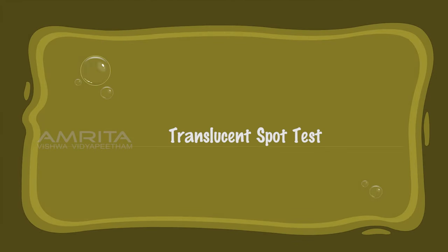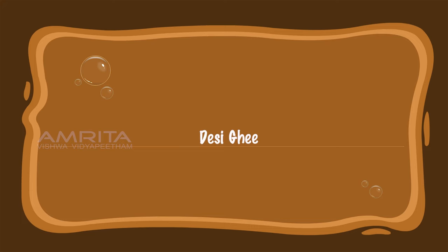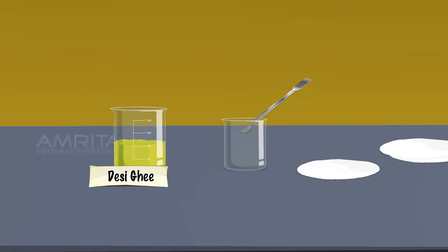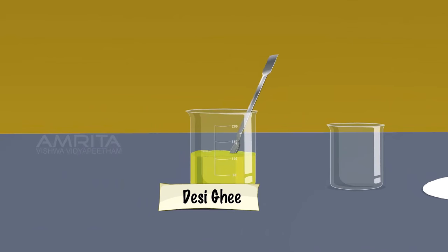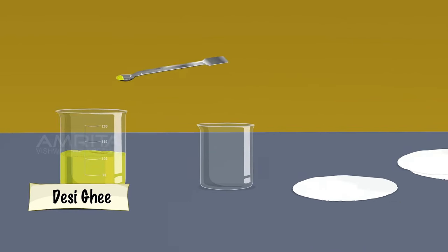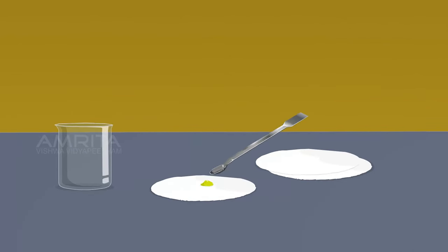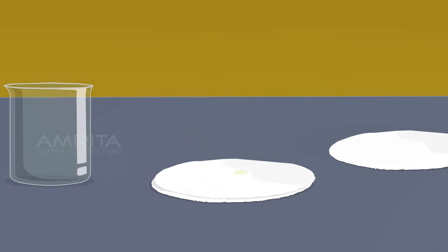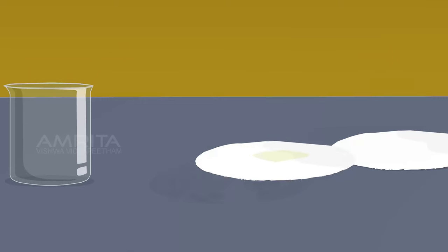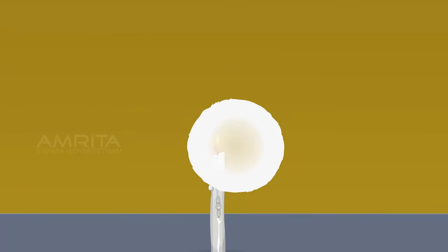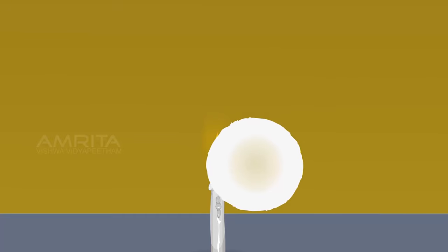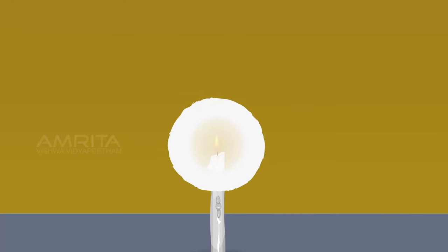Translucent Spot Test. Desi Ghee. Take a small amount of desi ghee using a spatula and put it on a filter paper. Then press the substance on the filter paper using another filter paper. A translucent spot appears on the filter paper. The reason is that when fat or oil is placed on a sheet of paper, it diffracts light. The diffracted light can pass from one side of the paper to the other.